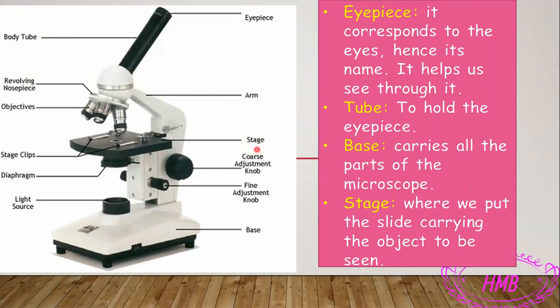So the stage is like actors when they want to make a play, they go to the stage and they start to act. It is the same thing here. The stage is where the object is placed and all the eyes will look at it.